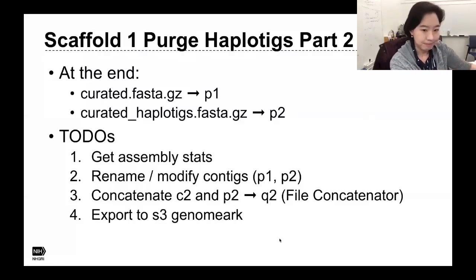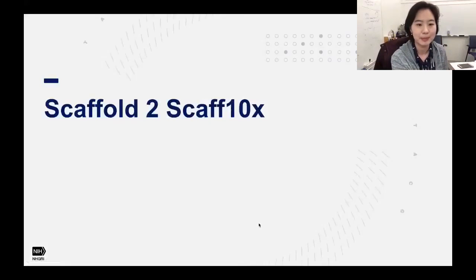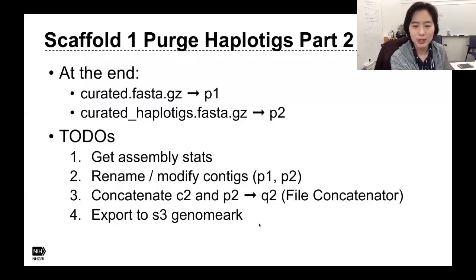Yeah. And the last step is to export everything back to our GenomeArk. Okay. Do you have any questions regarding Purge Haplotigs?